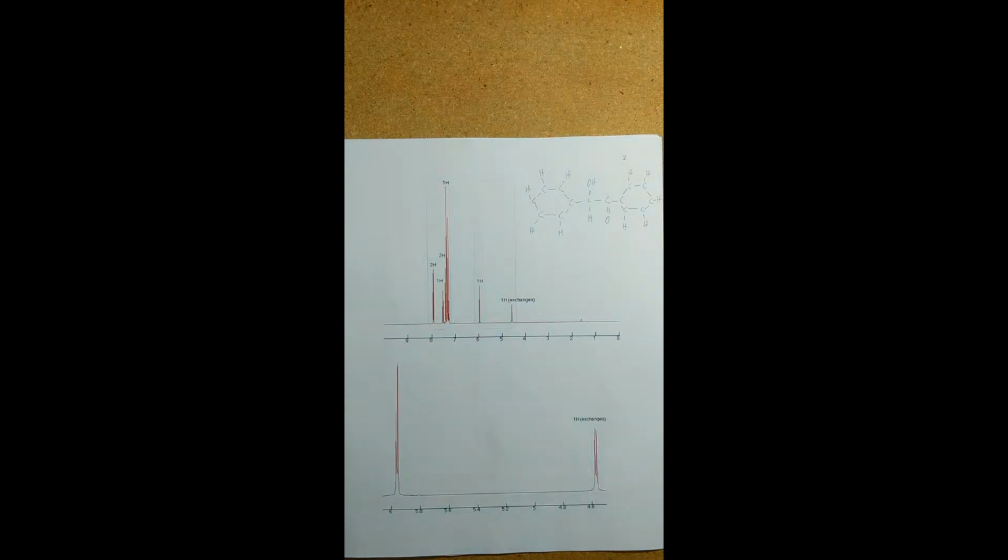Okay, now that the structure's been drawn in, and you can see that there are the correct number of carbons, hydrogens, as well as oxygens, we're going to dive right into trying to explain this in relation to the graph that we're given here.